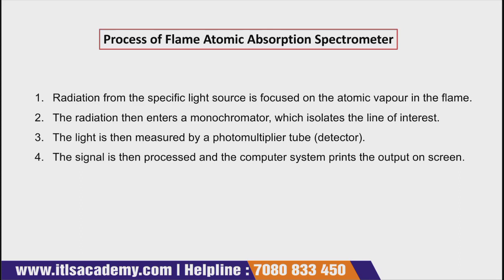In the excited state, every element possesses a unique spectrum that distinguishes it from other elements. The spectral lines are very sharp and rarely overlap each other. The flame absorption spectrophotometer takes advantage of this phenomenon. To identify and quantify these elements, of course, it requires a very high temperature.